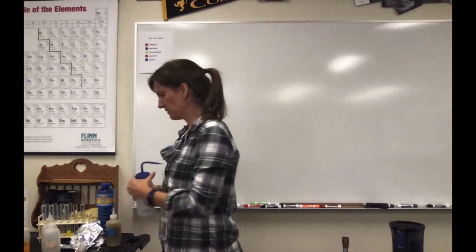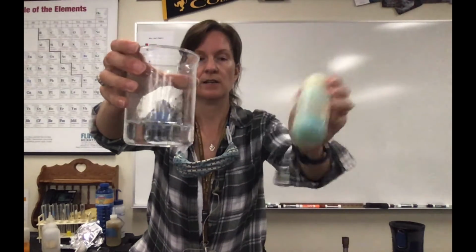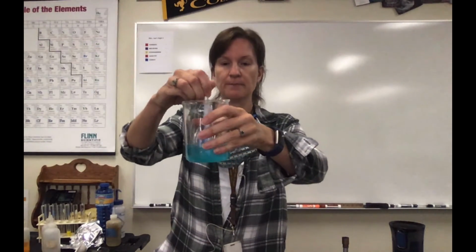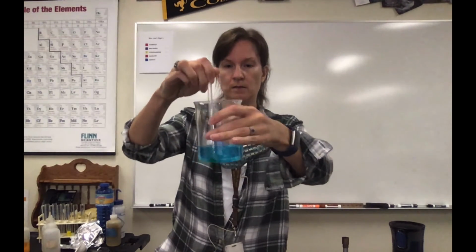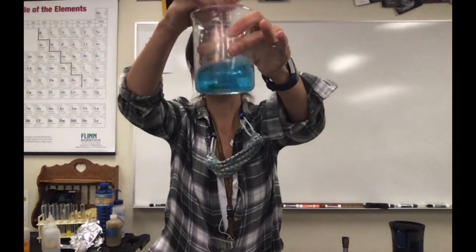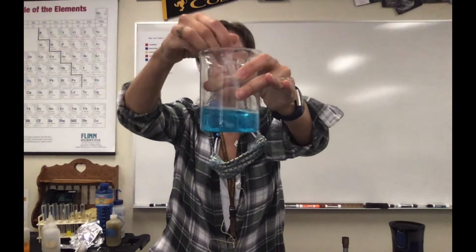Maybe I'm on number 7. It's going to be copper chloride in water. So water, and then you can see in this container, this is like a blue powder that I have in here. You'll see if I stir it up. I have a gigantic chunk left. But for the material that went, we would call this dissolving. I'll make observations after in relation to the dissolving and whether that dissolving is chemical or physical.